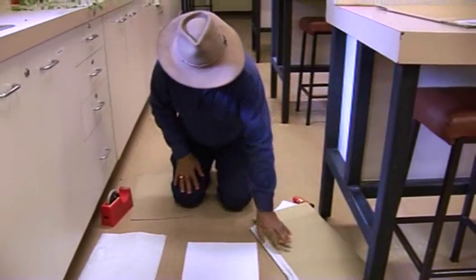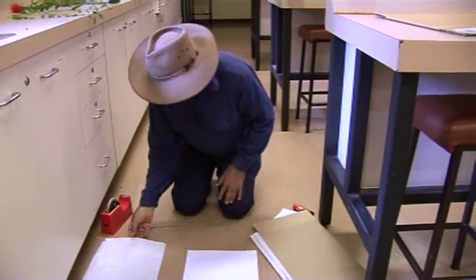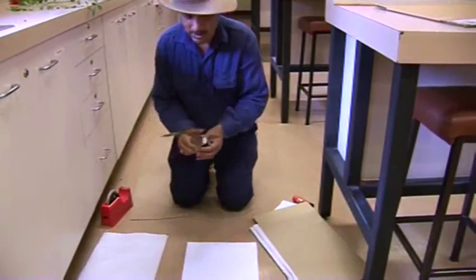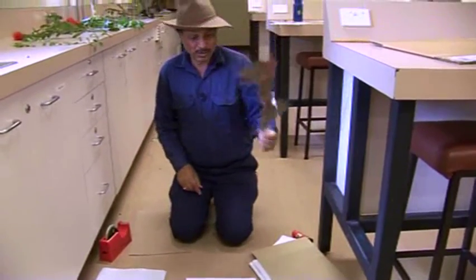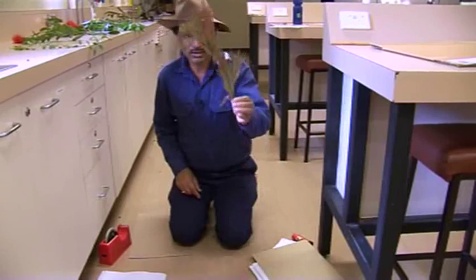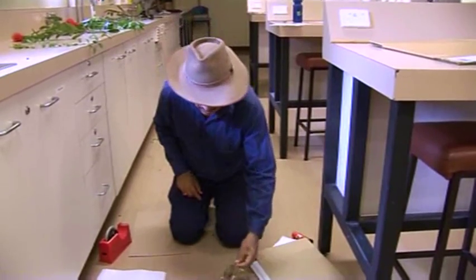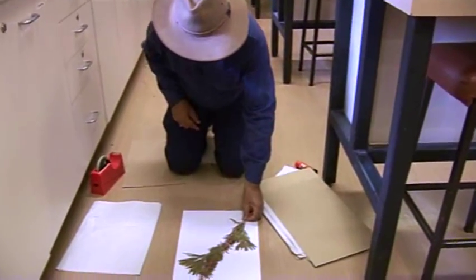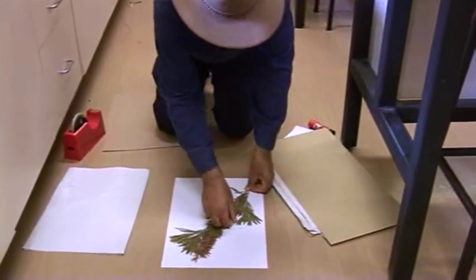So these samples — the ones we collected — are not dry yet. What I have done is I've got a dried sample here. Assume that your sample has already dried out. This is the sample that we have collected, and you need to place that one on the white paper.